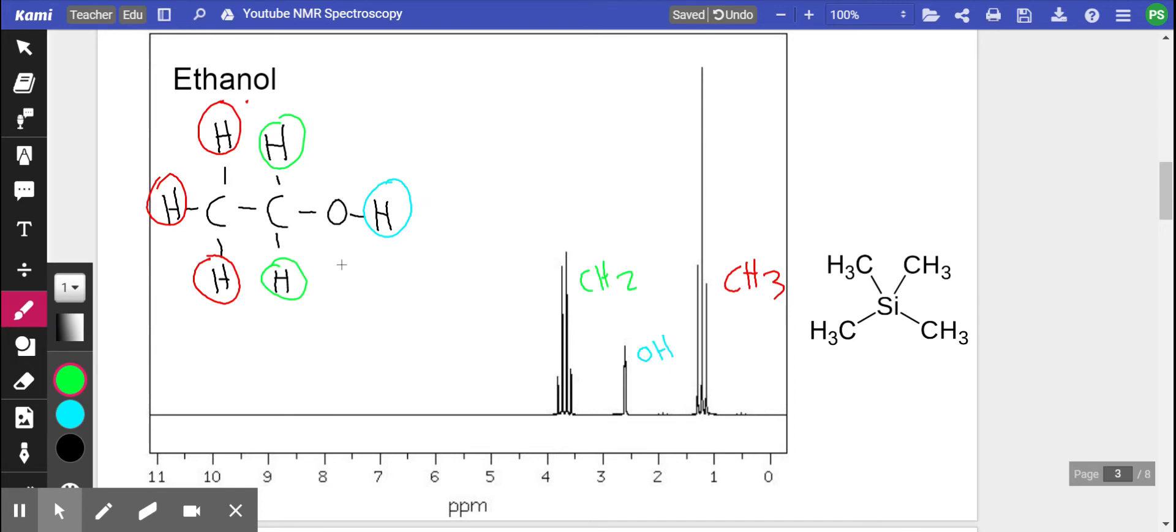Okay, now the interesting thing about NMR spectroscopy is that it gives you how many hydrogens there are per environment, and it does that by doing an integration. You don't have to do it, the machine does it itself. So if you know mathematics, integration is the area under the peak.